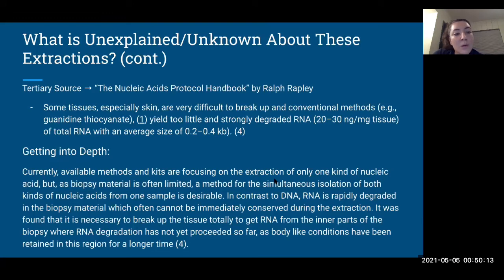Continuing on, this next point I'm about to make refers to our tertiary source, which was a textbook we used, the Nucleic Acids Protocol Handbook. They brought up the issue that some tissues, especially skin, are very difficult to break up, and conventional methods yield too little and strongly degraded RNA.